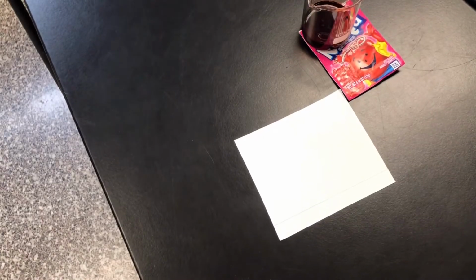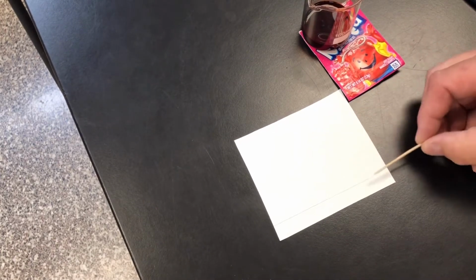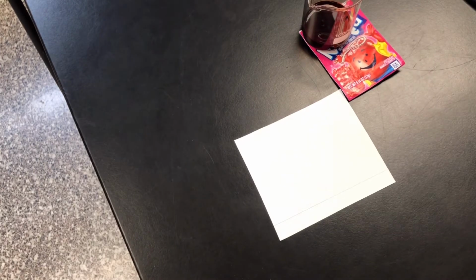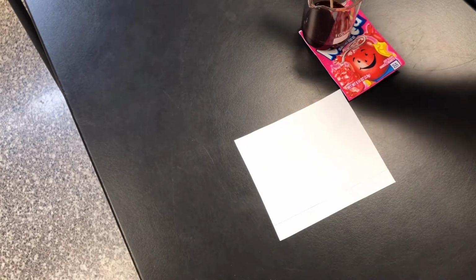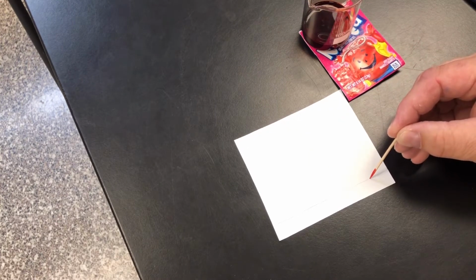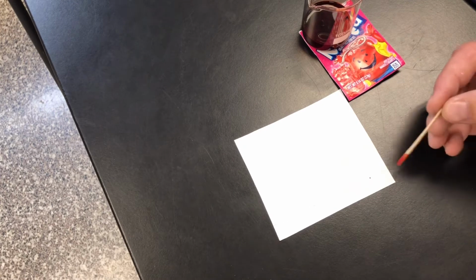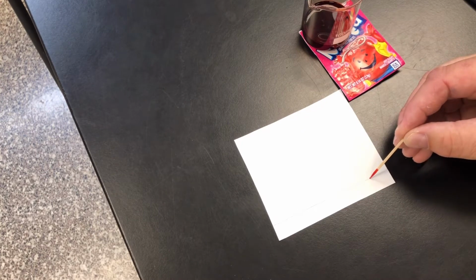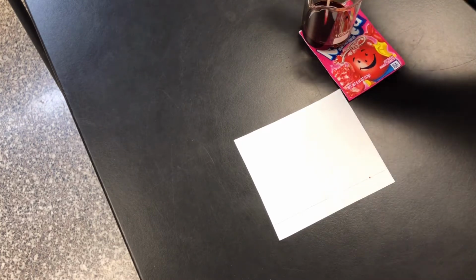One of the next things we do is get our filter paper cut out, and we've got our 2 centimeters line made with a pencil already, and we're going to practice just dipping in here and making tiny little dots. If we just touch that, that's going to be a tiny dot. Now that is not very much material, so we would want to dot this more than once. We don't want to push down and crush the paper.